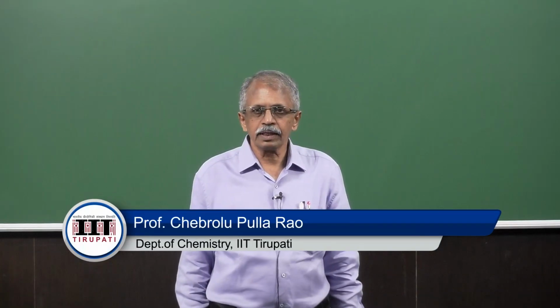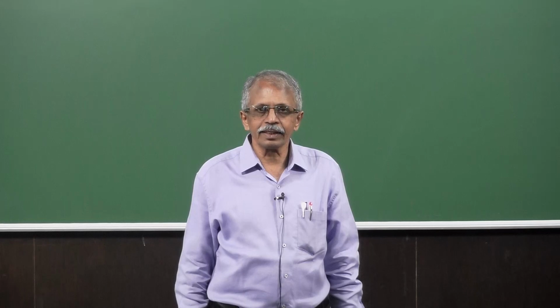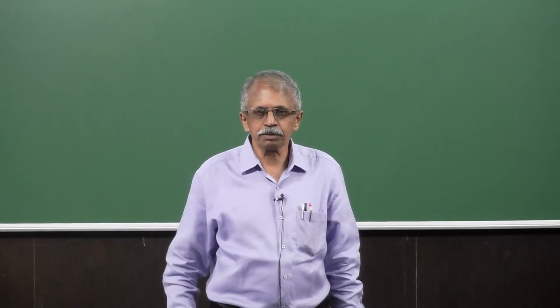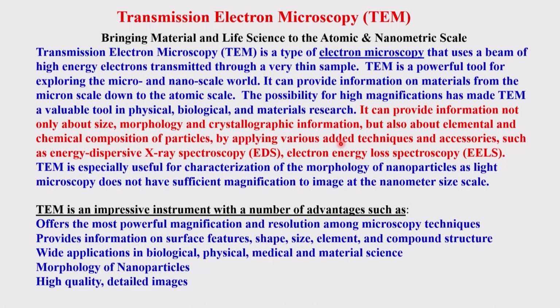Good afternoon and welcome back to another lecture in this series on microscopy. We already looked at atomic force microscopy, or scanning probe microscopy. Then we just began, towards the end of the previous class, electron-based microscopy, and I have already explained these features. We will be focusing on two aspects: one is the transmitted electrons, as in TEM, and the secondary electrons, as in SEM.